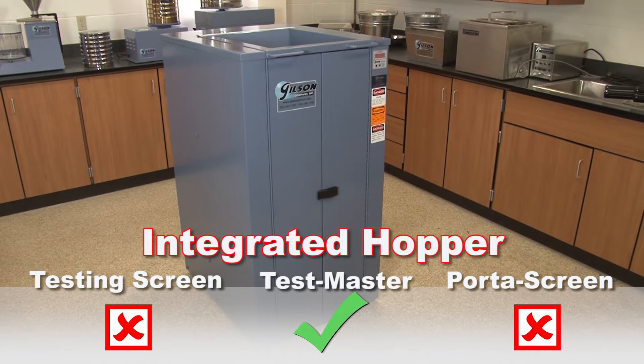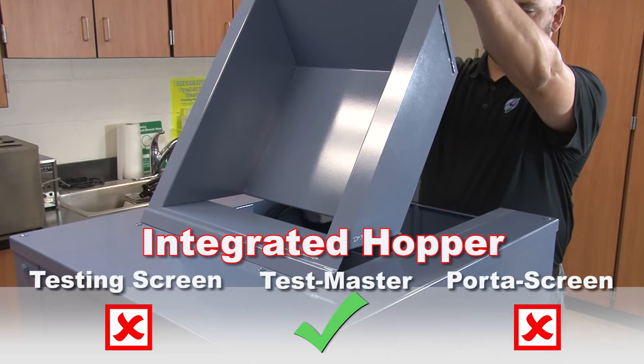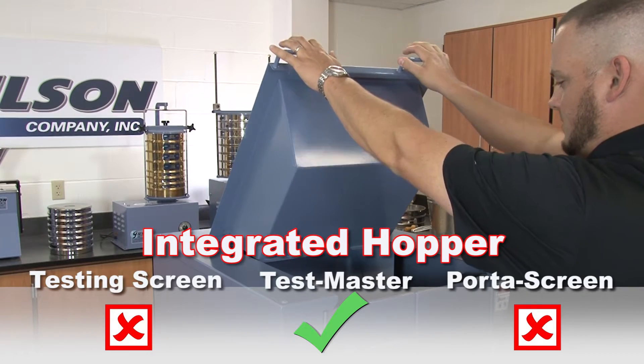Only the Testmaster models feature a generous 1.6 cubic foot integral hopper feeder for controlled, easy feeding of sample material, allowing the sample to be introduced incrementally while the machine is operating.